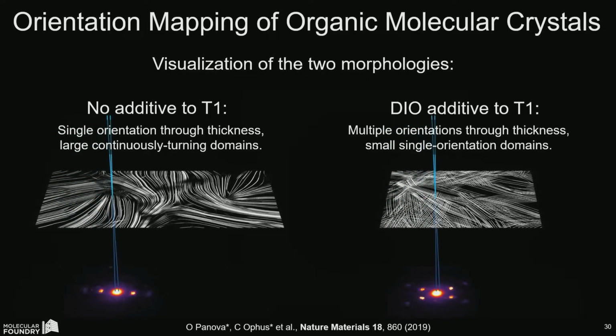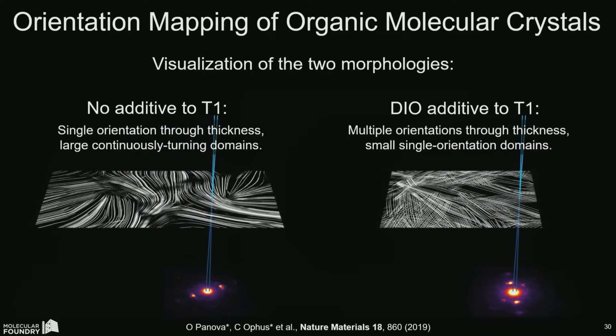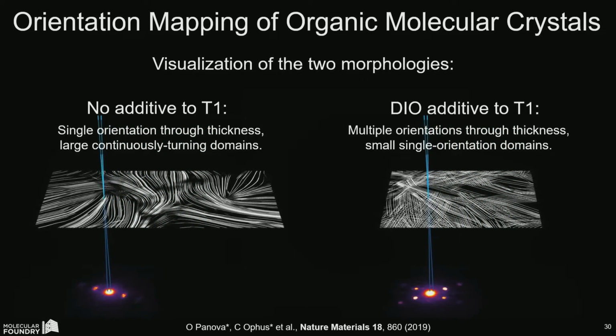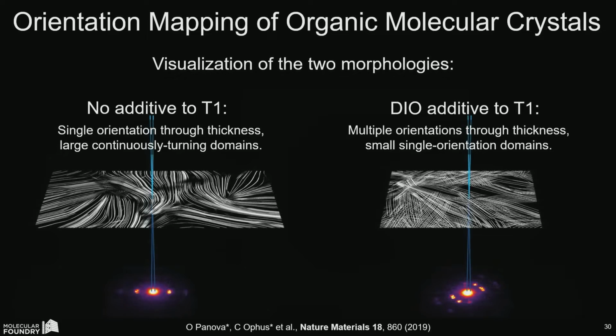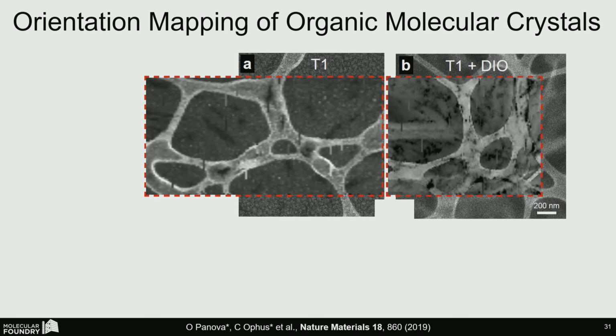And the raw diffraction data is being shown below it there. And so you can see on the left-hand side the slow, continuous rotation of the pi-pi peaks, or on the right-hand side, multiple overlapping peaks jumping as you go across a boundary here. So visualizing these orientations is tough if you have multiple simultaneous orientations. That's why we draw it that way.